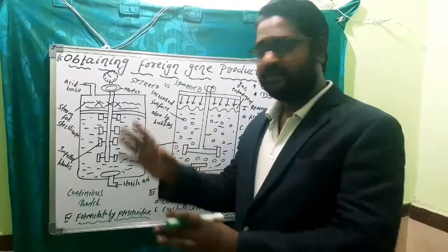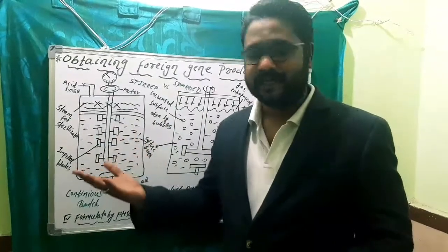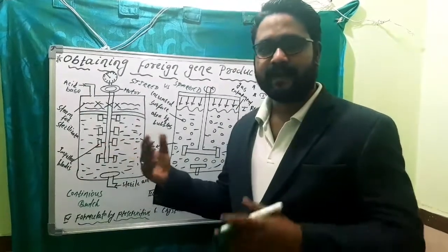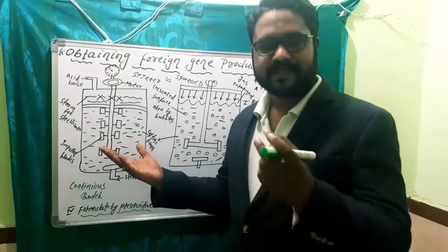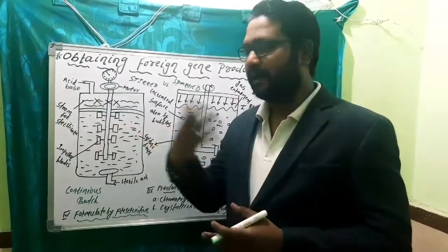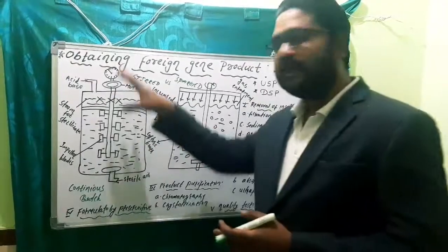It is called fermenter because most of the products are produced by the process of fermentation, and it is also called bioreactor more precisely because the nutrient medium through which we are producing the product by using specific microorganisms, they are living systems. Hence the reaction is being caused by these microbes or the cells or their enzymes. That's why it is also called bioreactor.